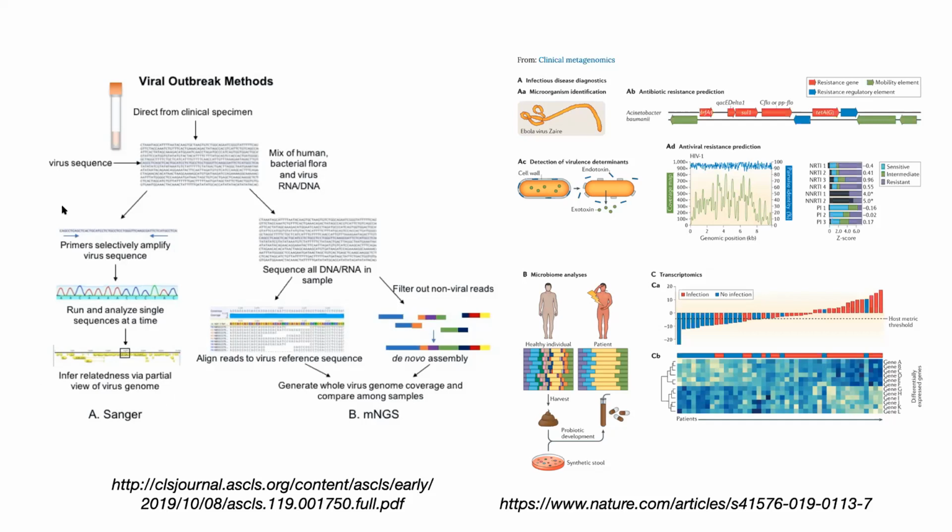And oftentimes, in that case, we use Sanger sequencing. Sanger sequencing is more precise, but it needs to have annotation for us to know where that sequence came from. So it is really designed around these primers.